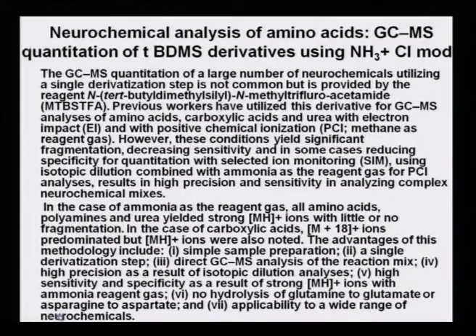And this is one such example where I have brought to your notice that even derivatization is a very crucial step in order to carry out specific GCMS analysis.